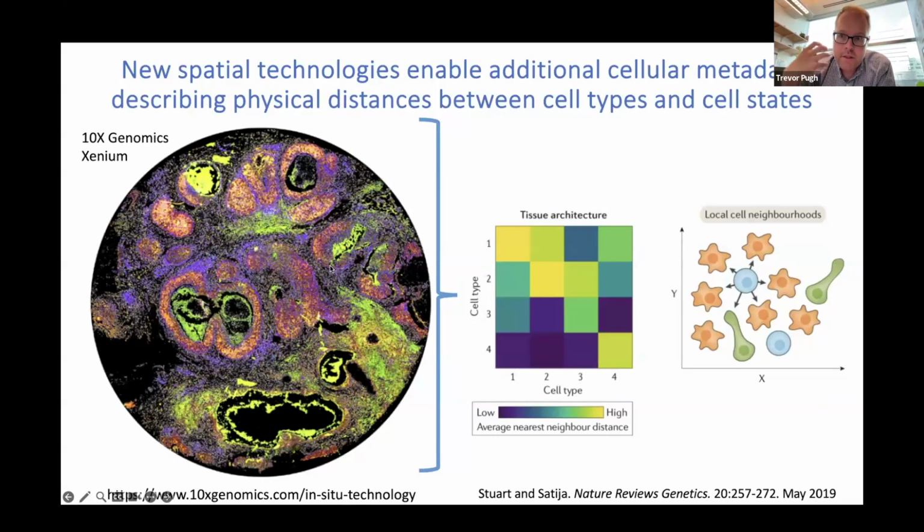So all the concepts I've just talked about, how to capture single cells, how to measure RNA, now have an additional layer of information with the advent of spatial technologies and spatial transcriptomics. I hesitate to call these spatial RNA sequencing because some of these spatial technologies aren't always using sequencing. Sometimes they're just using probes, but they can use hundreds and soon to be thousands of probes to try to look at the entire transcriptome.